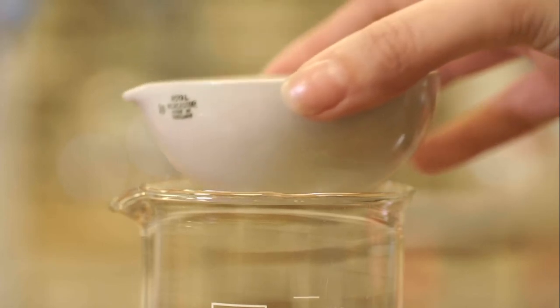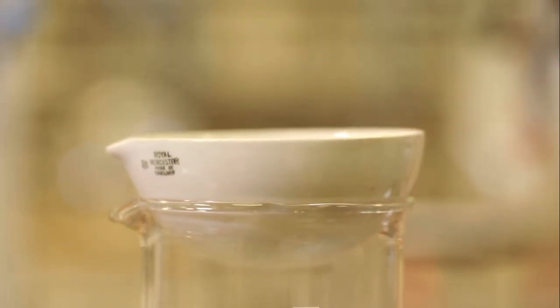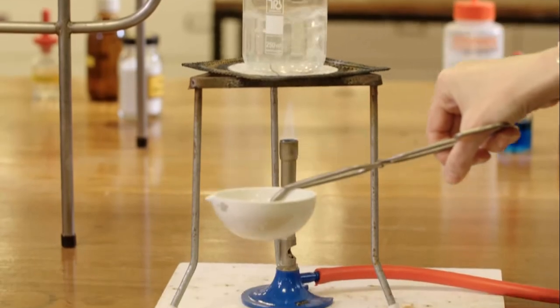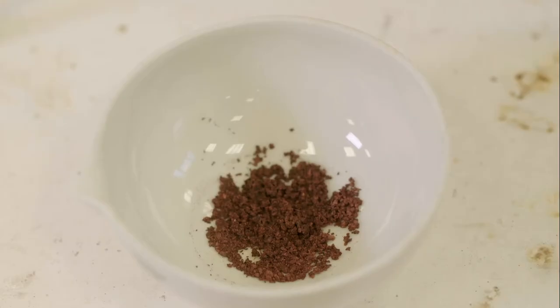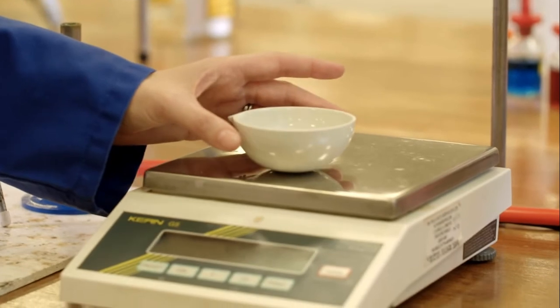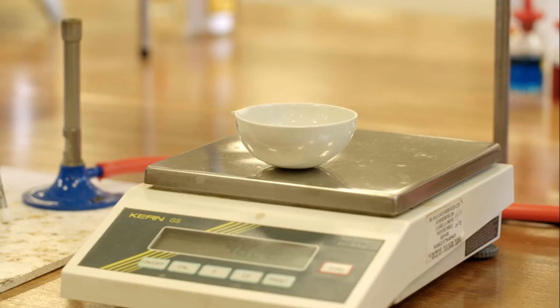The evaporating dish is placed back on the hot water bath for another 5 minutes. Again, the dish is removed from the heat and left to cool, and its mass is recorded again. The process is repeated until a constant mass within the range of 0.04 grams is reached for 3 heatings. This constant mass is used for the calculations to determine the empirical formula for copper chloride.